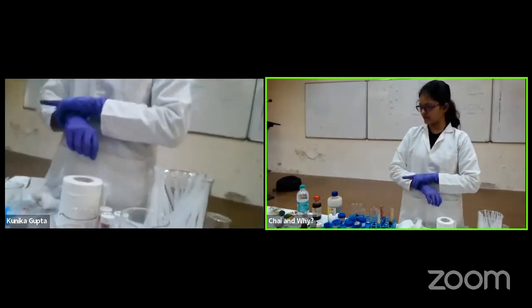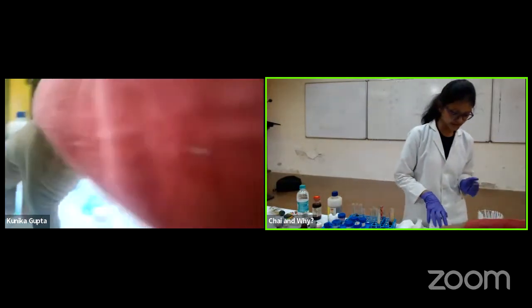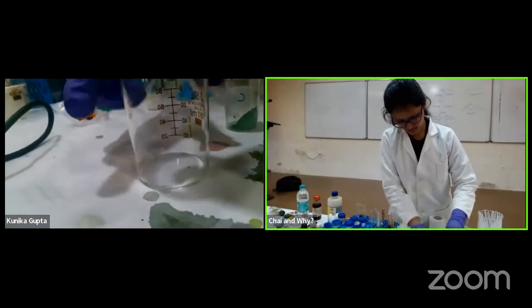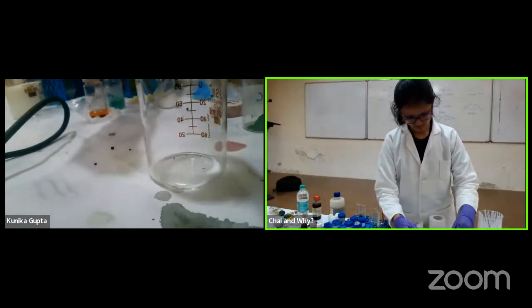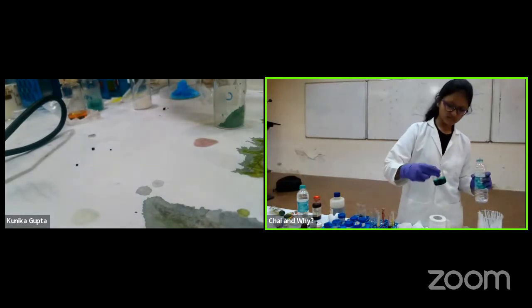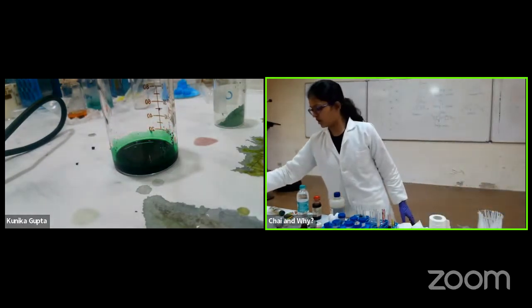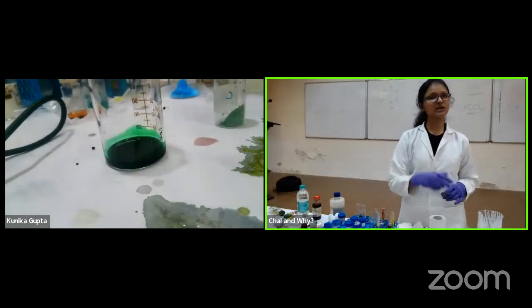Okay, so let us prepare for the chromatography. So here I will take two colors. Again, I'm not doing it with the exact compounds, the dye. I'm just taking colors. Here I have a green food color. It's just the basic food color that we have at home. And this is a chalk, a substance which will absorb water. So let's see if the green color that I have added is only a green color or not.